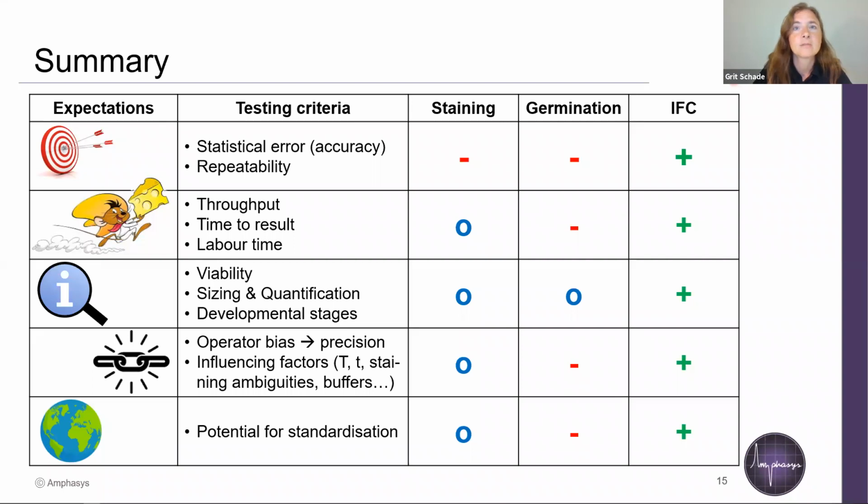There came up another question about whether you have to treat the pollen somehow before measuring them. Well, you just have to put it in the right buffer and sometimes filter it. It depends on the sample quality, but I would say just use the right buffer and filter it with the appropriate filter that we normally provide, and that's basically all you have to do.